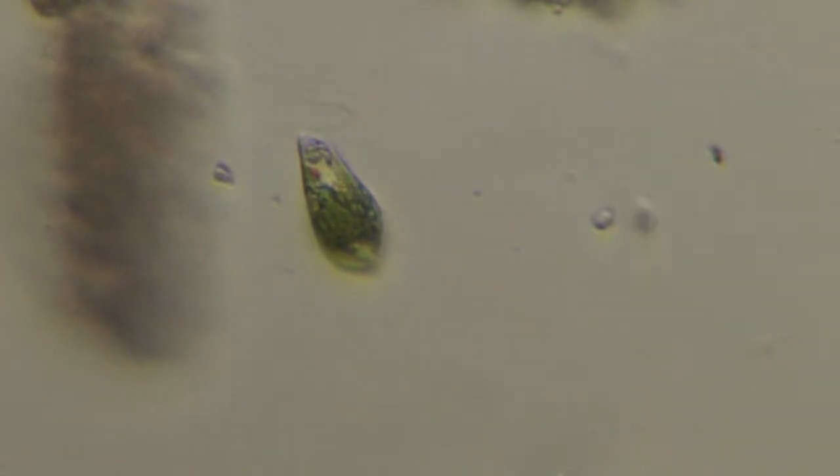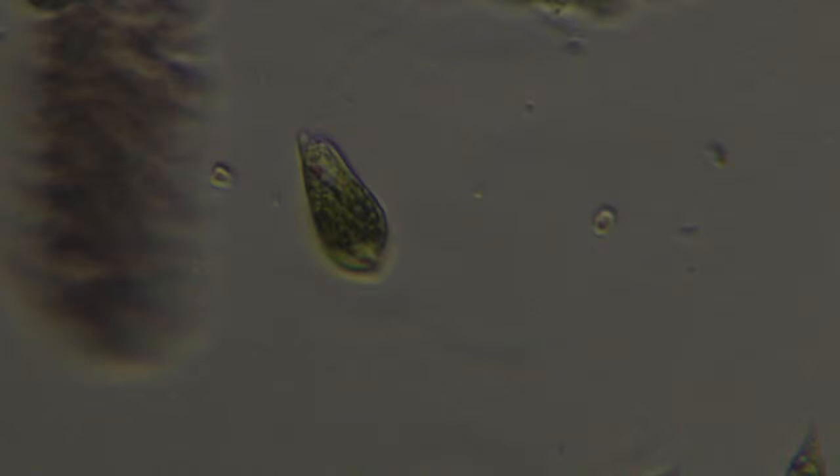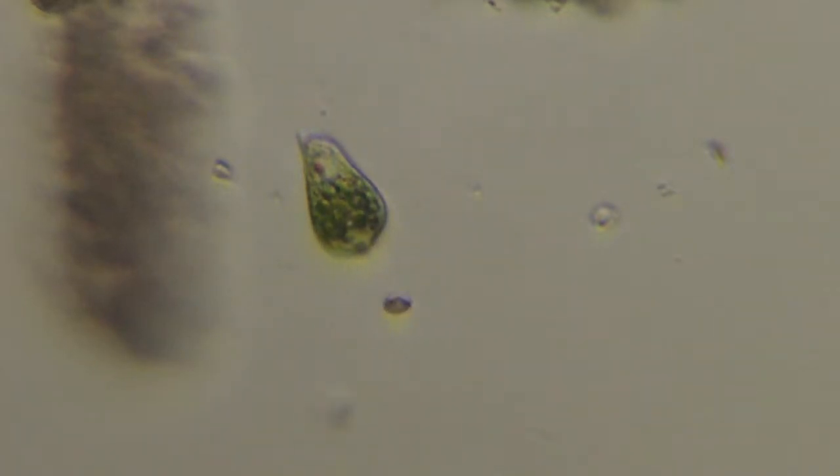A little more light maybe, there's all kinds of stuff cruising by. A little more contrasty there, you can see the detail on the edge a little bit there, sharper lines. So yeah, sometimes you can just hang out in one spot and things go floating by, which is a nice, comfy way to do it.